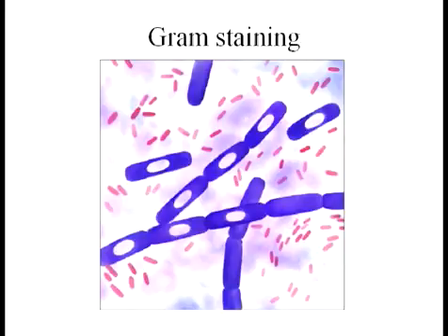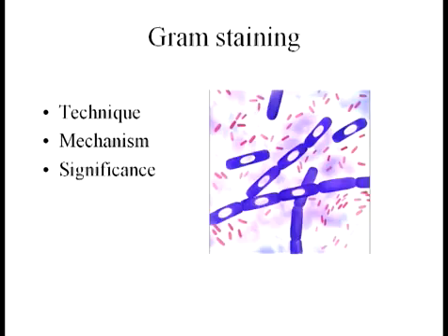Today I'm going to talk about a widespread and very useful technique known as gram staining. First I'm going to give a brief introduction to gram staining, then I'll discuss the technique and the mechanism in detail, and then finally we'll discuss the significance of the technique.